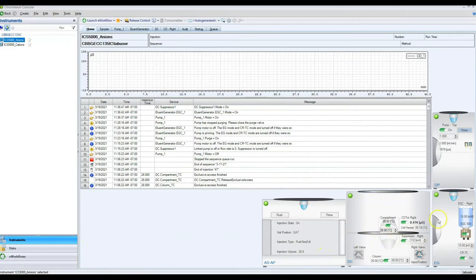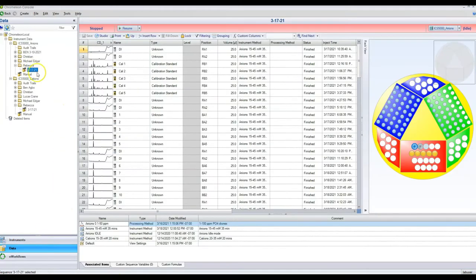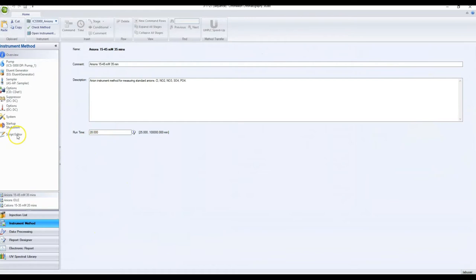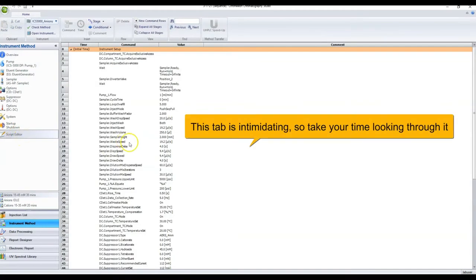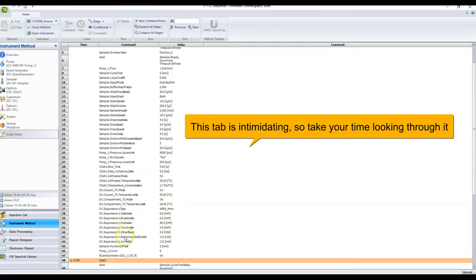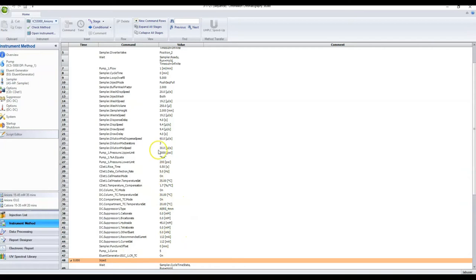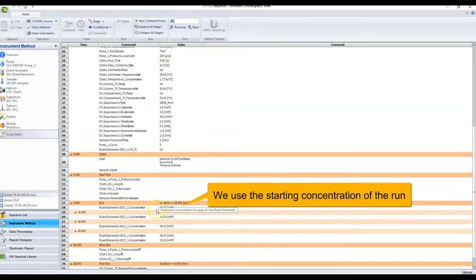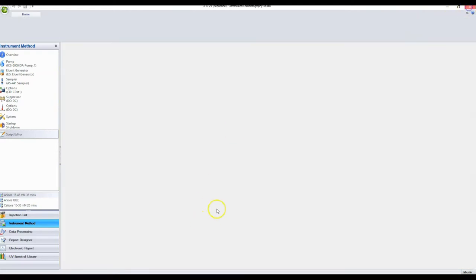Here's how to verify your settings from a run program. Go to Data, find an anion run using the instrument method you want, and open it up. Go to the Script Editor and scroll through until you see all the settings. The suppressor recommended current is 112 milliamps — which matches what we set. The pump flow rate is 1 milliliter per minute. And the eluent generator concentration is 15 millimolar. That confirms our settings are correct.